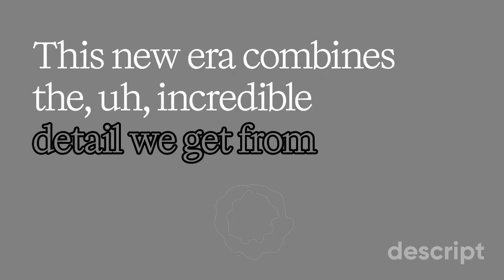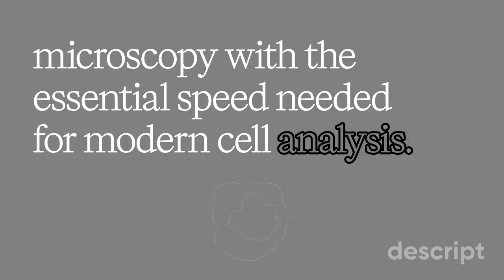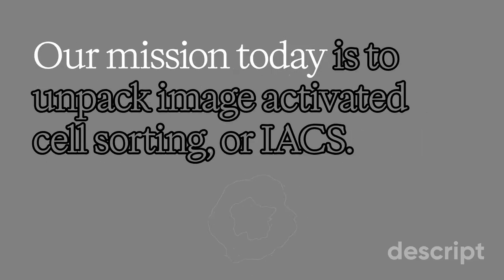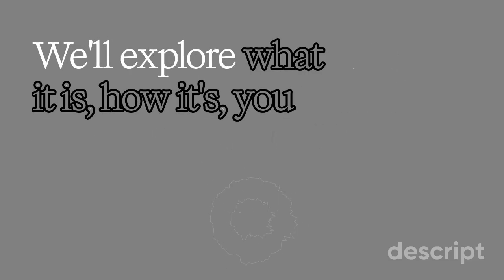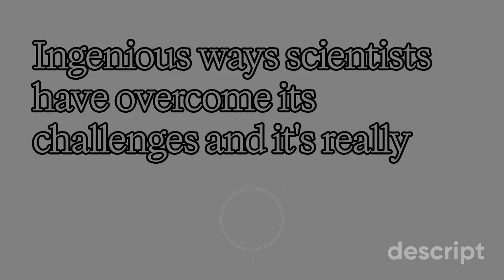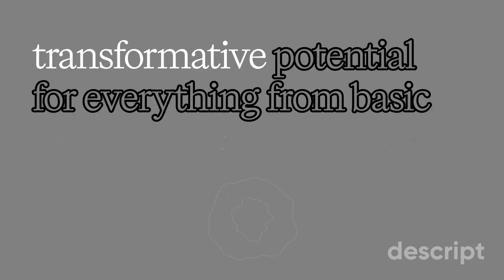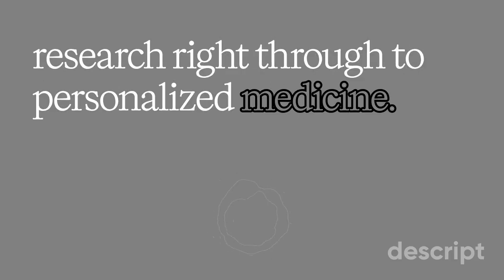A new era. Yeah, this new era combines the incredible detail we get from microscopy with the essential speed needed for modern cell analysis. It's a real step up. And that's exactly where we're going with this deep dive. Our mission today is to unpack image-activated cell sorting, or IACS. We'll explore what it is, how it's different from older methods, the ingenious ways scientists have overcome its challenges, and its really transformative potential for everything from basic research right through to personalized medicine.